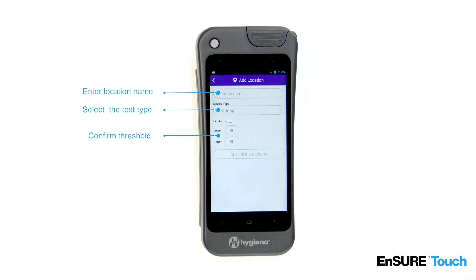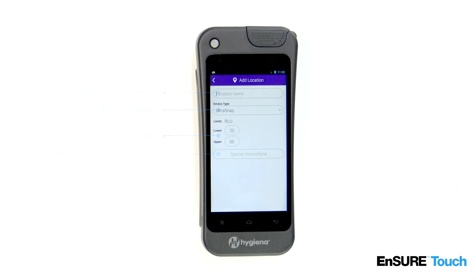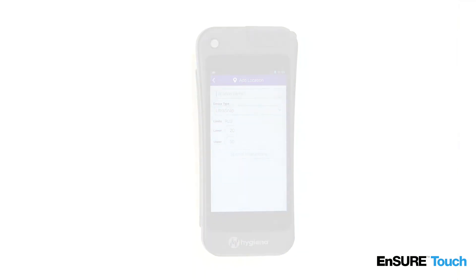Confirm the upper and lower thresholds. Enter in any special instructions for the person that will be performing the testing. Touch the back button to automatically save your changes.